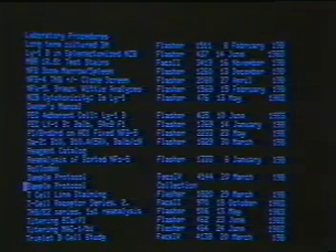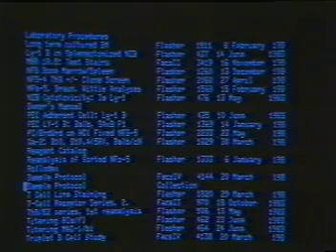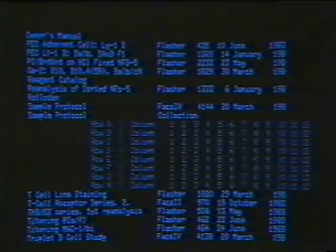As the first step to collecting data for a sample, you position the cursor at the appropriate sample number and press Execute to bring the collection label on screen. Watch again as we press Enter Execute to toggle collection mode, then send the cursor down level into the collection drawer. You may collect sample data in any order. We will start with B3. Pressing Execute reveals the label.